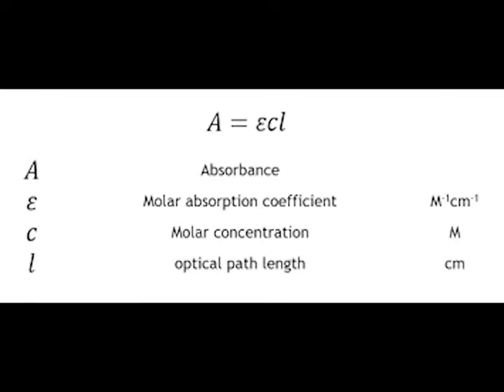Beer-Lambert law is shown. You will need to use this to determine the concentration of your unknown.